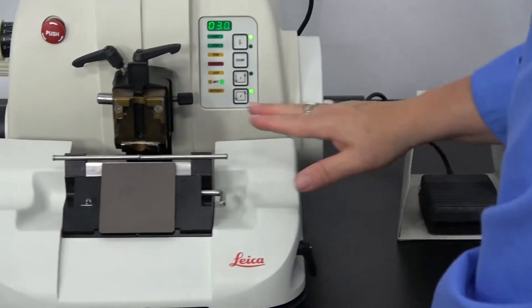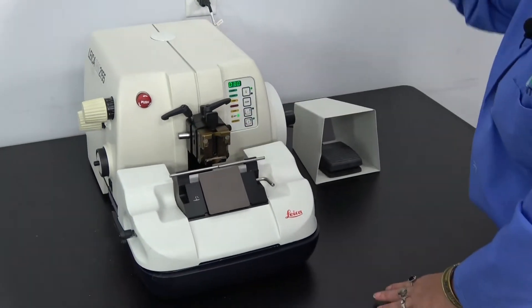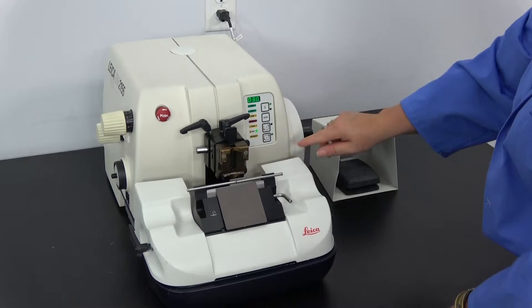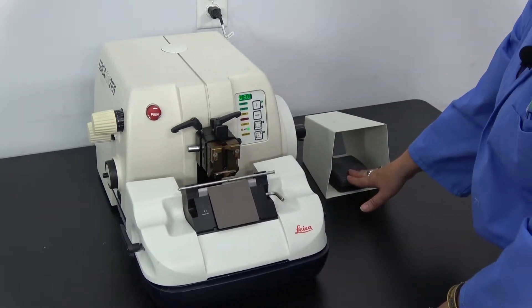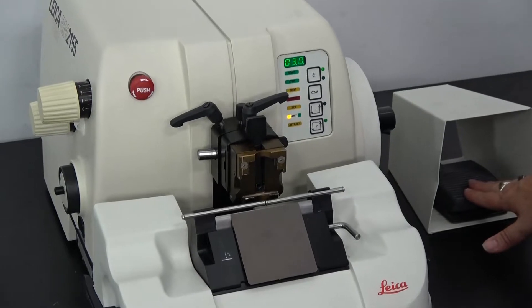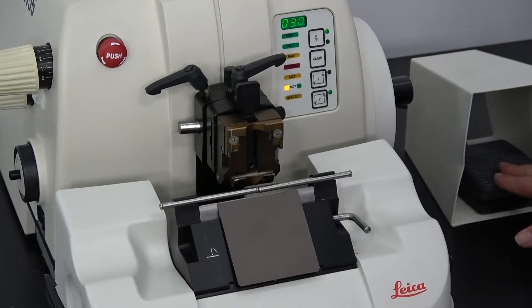This foot pedal operates the actual moving of the head for the slicing action. You need to set it whether you want it to do one pass at a time or multiple passes. Right now I have it set for multiple. We're going to give it a slight tap. I have it set on the lowest speed setting. It goes very slowly down and fast on the retract.